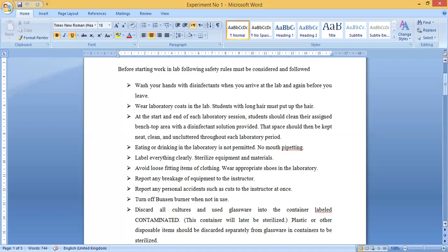Avoid loose-fitting items of clothing. You should not wear frocks or long, heavy sleeves — your clothing must be properly fitted. Otherwise, loose sleeves or frocks can cause the breakdown of materials, or may dip into chemicals or catch fire. Loose clothing should be avoided, and you should be properly uniformed in neat and clean clothes.